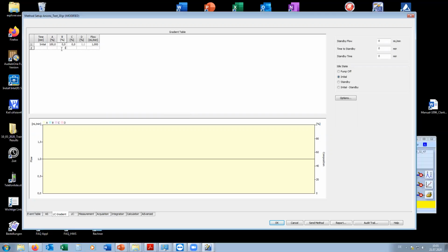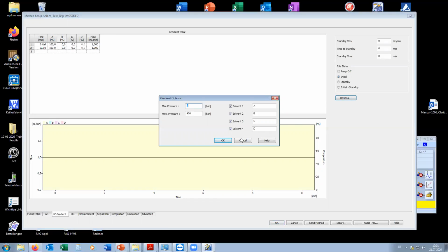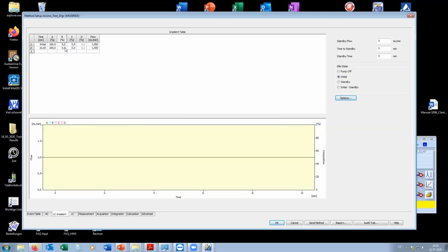I enter 100, I enter the time and the flow. Maybe I'm set to isocratic.